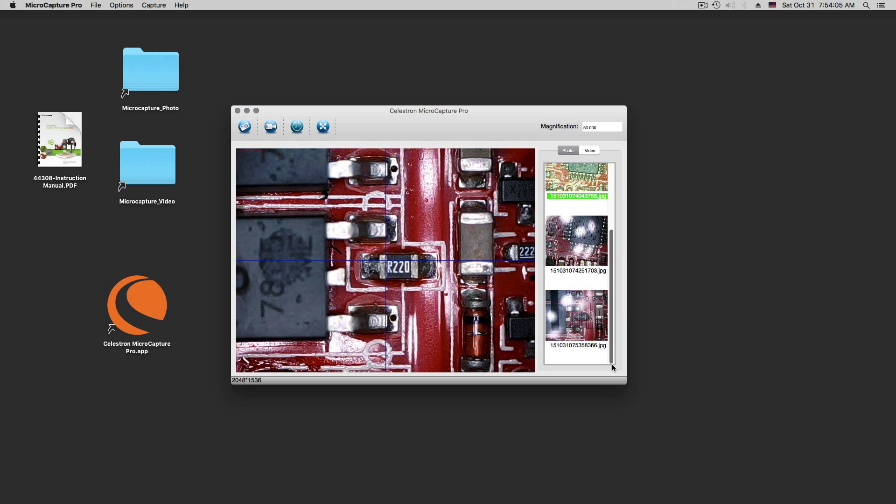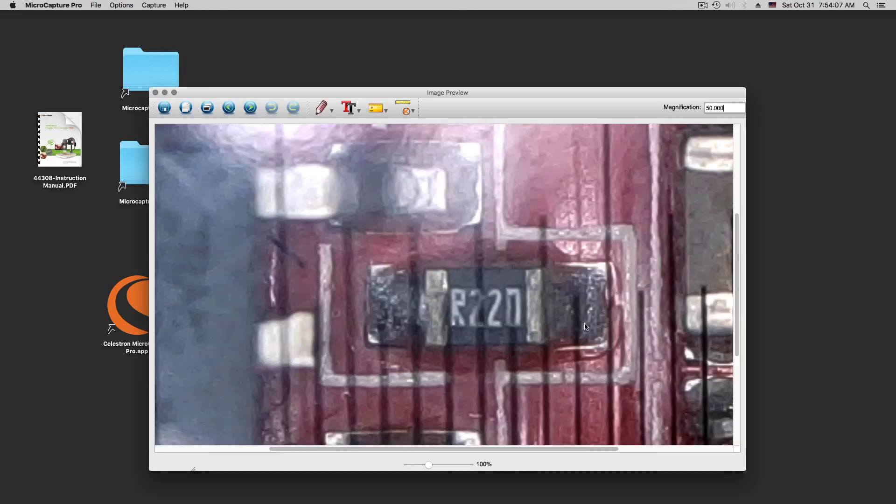And here on the right, you have all your pictures. Double click on it. And then you go here to calibration. And then you measure from, let's say, here to here.